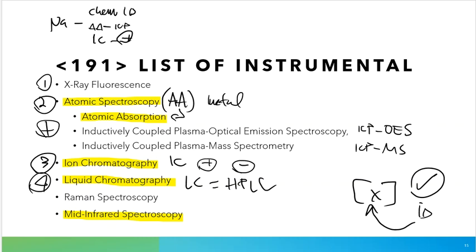I can take this sample and run it on a machine, and see if the presence of that particular piece is there. What the LC will also allow me to see is everything that we would classify as an impurity. So not only would I see what I'm supposed to be looking for, but anything else that is coming along that's deemed an impurity, I'll be able to see some of those things as well.